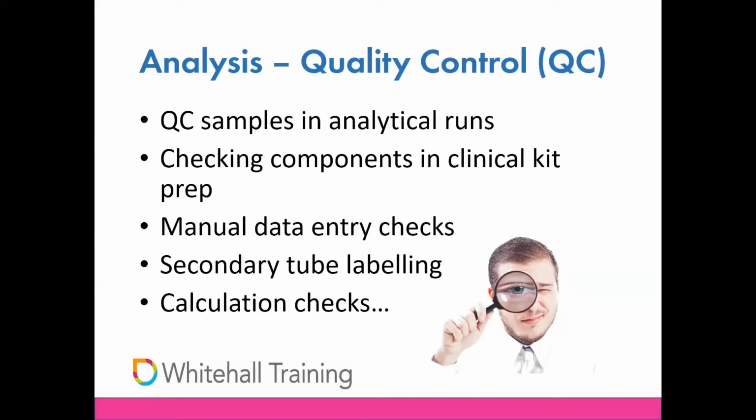QC checks, like QA, are most effective when they're performed by a second person, or some QC checks are obviously done automatically by the equipment itself. This is because you don't want a technician checking their own work. The records need to capture the fact that a QC operation has been performed, when it was performed, and who did it.